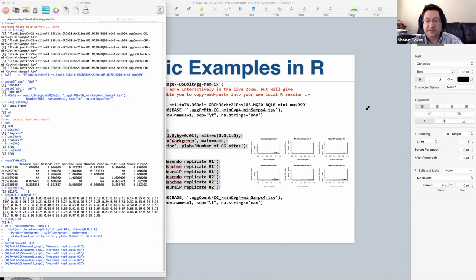Okay, I don't like that aspect ratio, so we could put that in code, but let's just GUI mush it around. Okay, so my next question is, can you guys see this window, or are you going to be able to see all my R windows, or is the screen sharing stuck to just this one R window? Can you see this figure? Oh, you can't see the plots. But if you're following, okay, so I don't know if you're following.